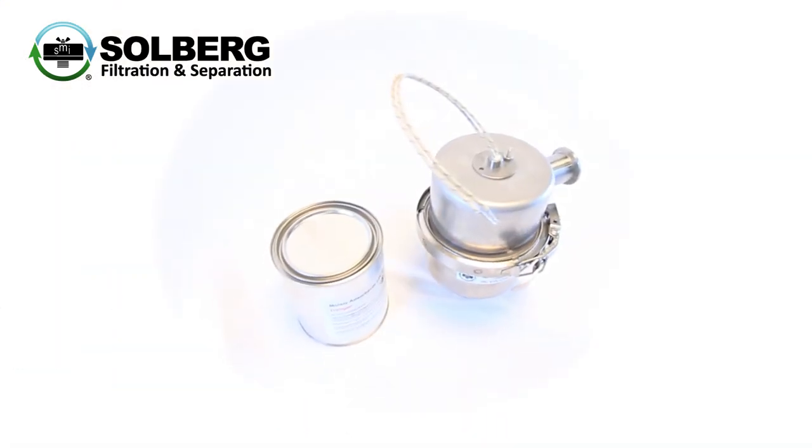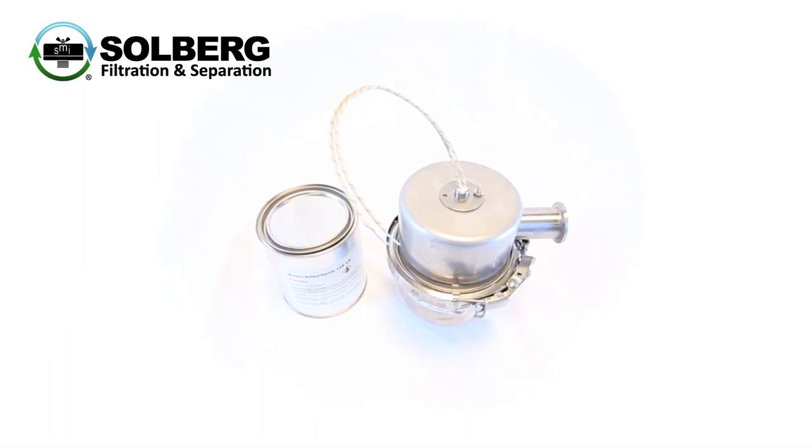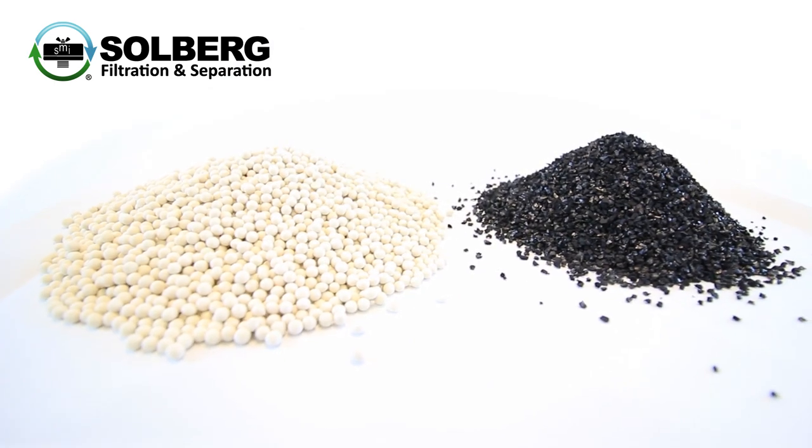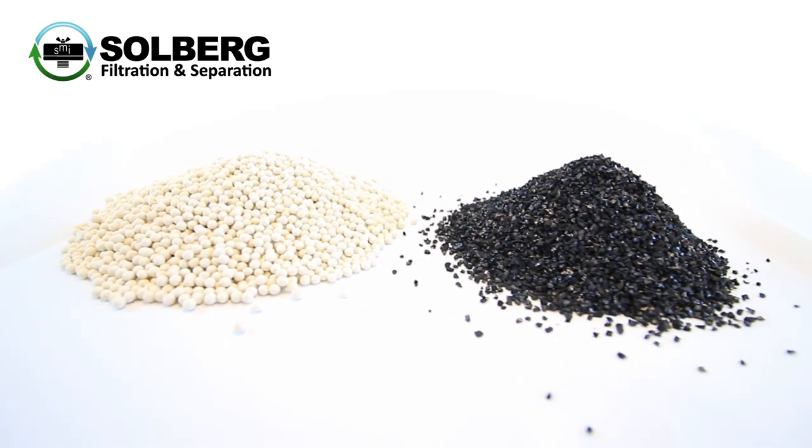Configurations include molecular sieve for capturing water vapor and an integrated heating element for on-demand desiccant regeneration, chemical absorbance and neutralizers such as activated carbon, activated alumina, and other specialty granulates.